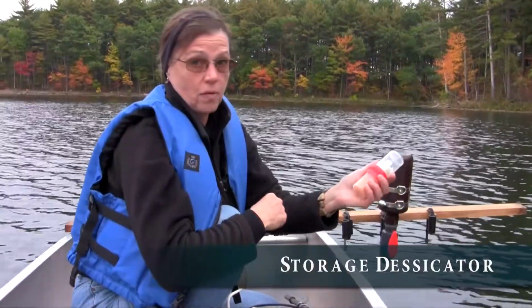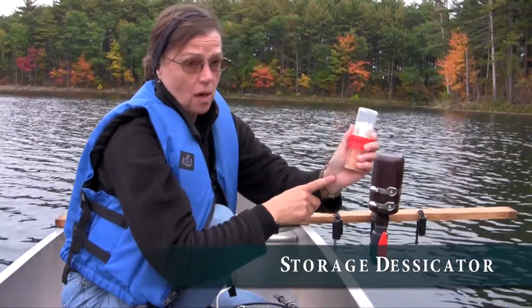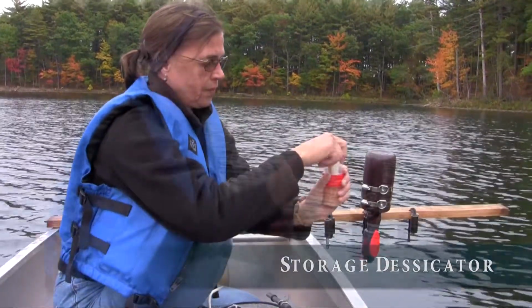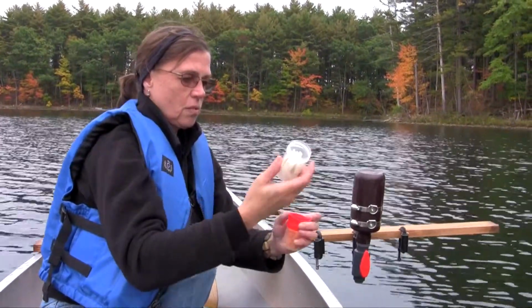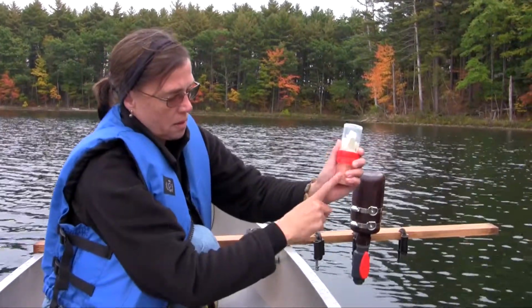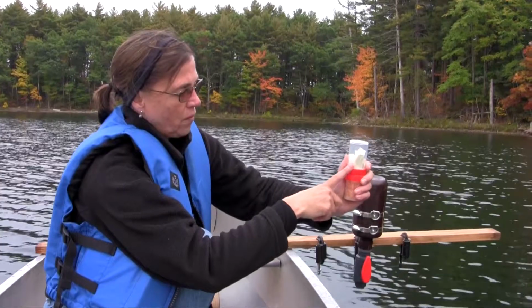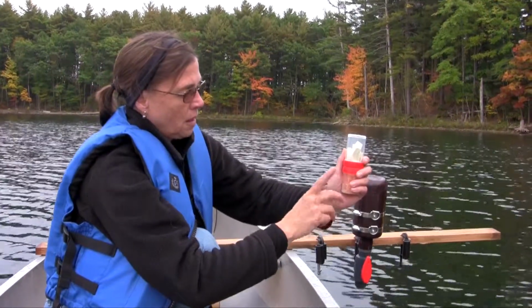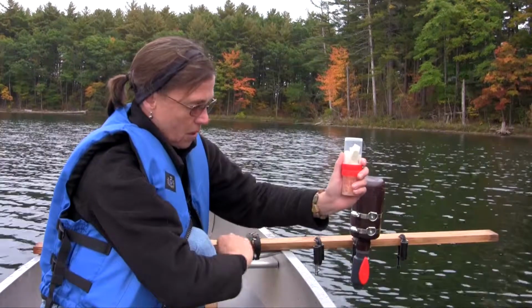So I mentioned earlier we had these field desiccators. These we use after we have dried the samples. Just curl it up into a little tube. We can put the 3 of them in here. We screw this on, and this will keep the samples nice and dry, free from contamination, free from getting wet by anything, and transport them back to the lab, and they're all dry and ready to go by the time you get back.